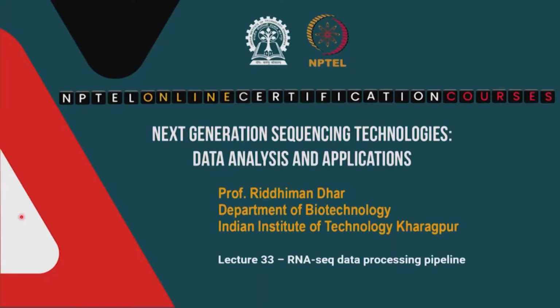In the last class, we had an introduction to RNA sequencing. We talked about different methods, for example, short read RNA sequencing, long read RNA sequencing and direct RNA sequencing. So, we will now slowly get into the methods. How do you actually get the data processed? How do you set up the pipeline and what kind of tools and methods do we use?